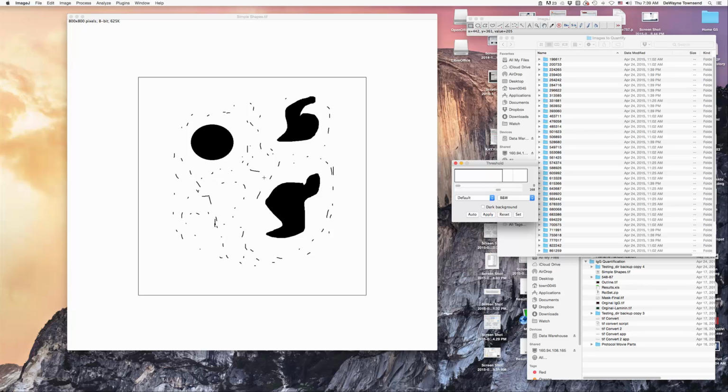But you also note we get some noise in here. Okay, so now what we want to do is determine the area of each of these dimensions. For this one, it'd be pretty easy, because you could just trace it or use a circle tool. But our images, our lesioned areas, are never nice little circles. They're always a little bit crazy like this.